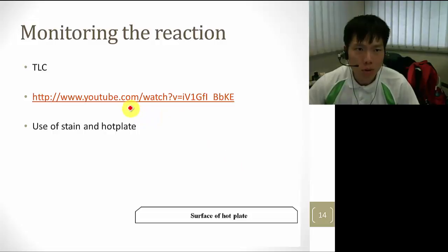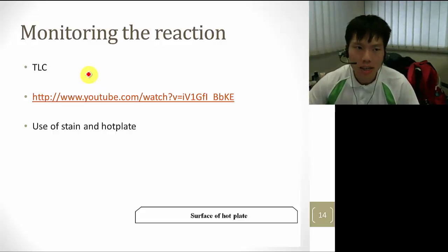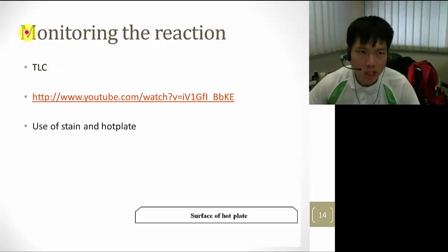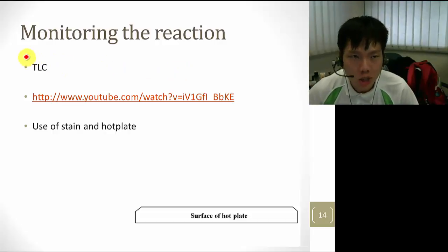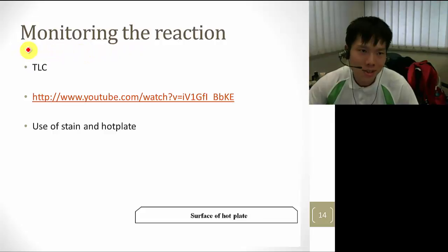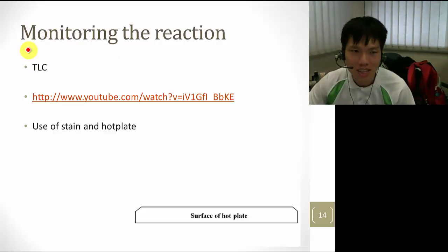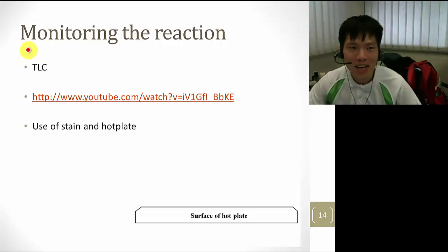Now at the same time, you have to monitor the reaction to see when it will finish. It doesn't mean that when the lab manual says it should finish under an hour, you just stop at an hour. In all chemical reactions, especially in organic chemistry, you have to check intermittently whether your reaction mixtures have finished reacting or are still in their infancy. You can't just leave it to boil overnight for 24 hours thinking it will be perfectly fine the next day when you come back from home.